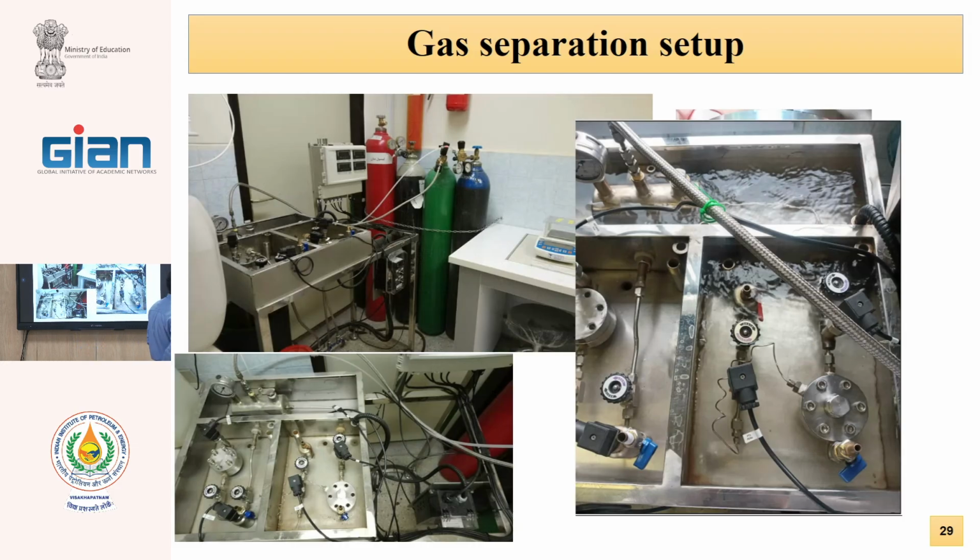Another system is gas setups. For testing of the gases, there are two methods: constant volume and constant pressure.